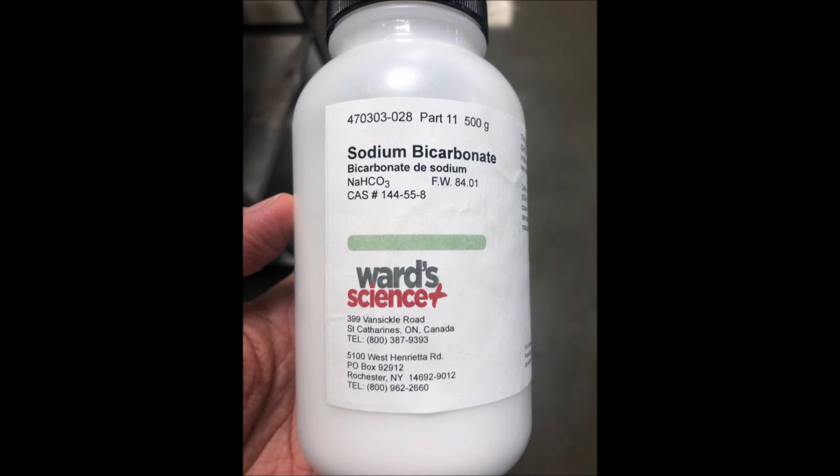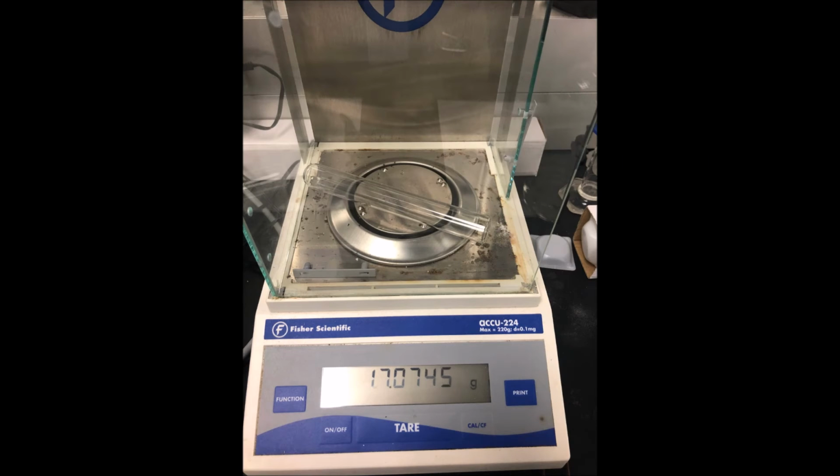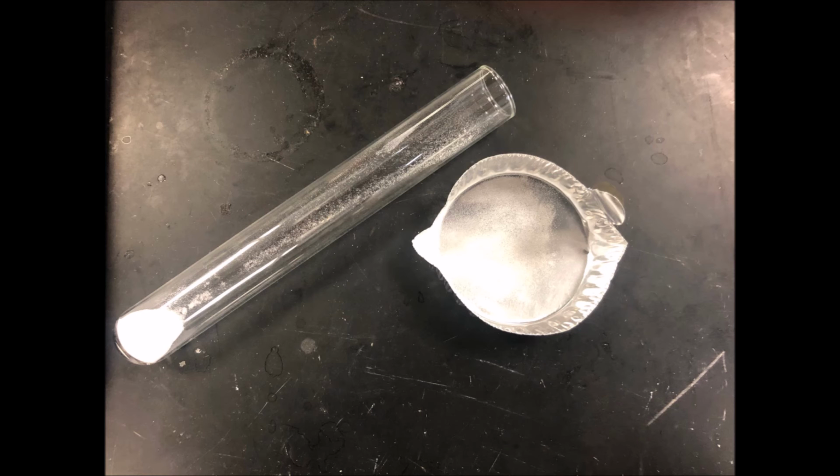Okay, so what did I do? I got some sodium bicarbonate and I measured exactly 1.430 grams of this reactant. Then I took an empty test tube and measured its mass for reasons that you will understand. Notice there's a little bit of bicarbonate still sitting in that little pan. That's going to be important.